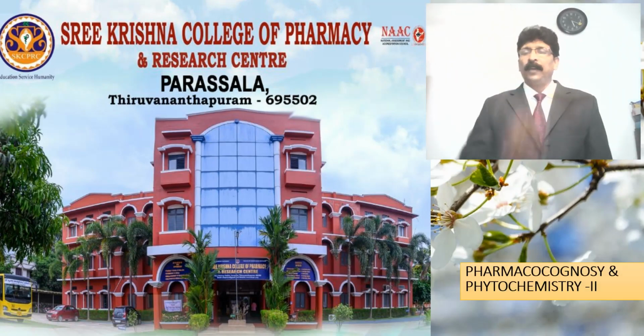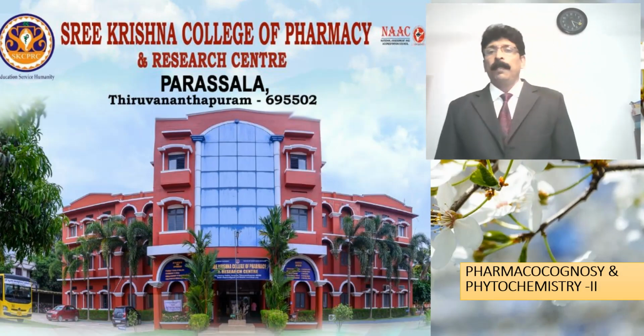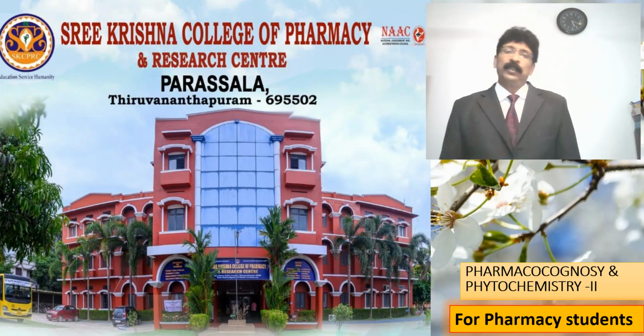This is for Pharmacognosy and Phytochemistry 2 for the 5th semester B Pharmacy students, and it will be useful for the other students also because it's a common extraction method, modern extraction method. The chapter describes various parts and is a very interesting chapter.